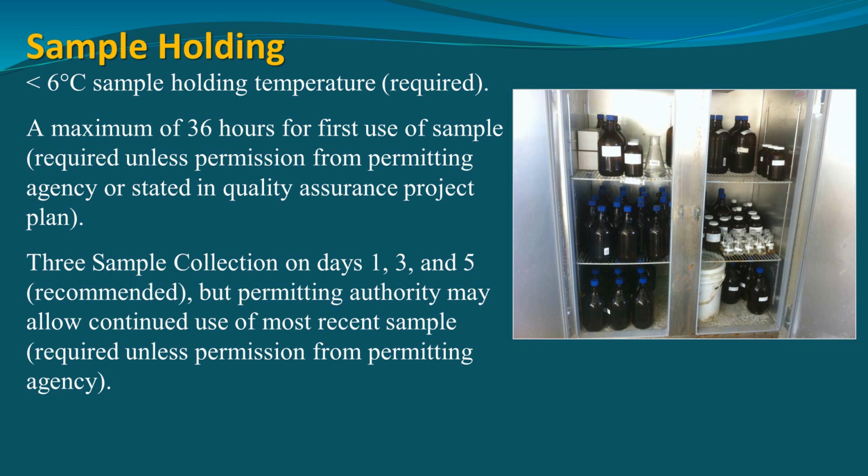Within SWRCB, there's a 48-hour holding time. It's program specific. So we get an extra 12 hours, mostly for logistical reasons. On tests where you're collecting 3 samples, sample collections are usually on days 1, 3, and 5 of the test, and each sample is used for 2 days within that protocol.